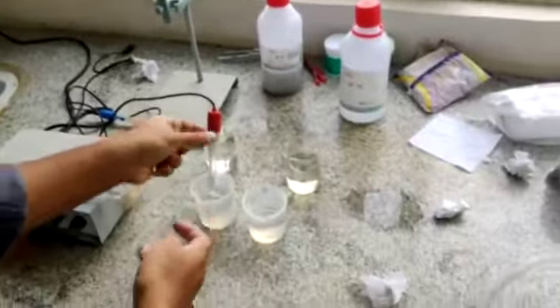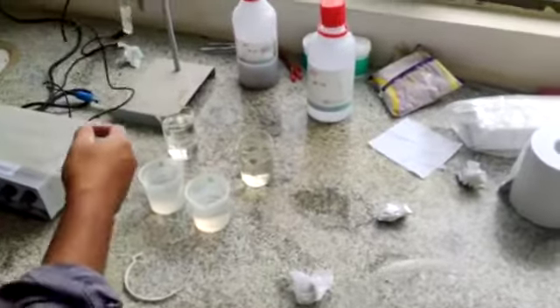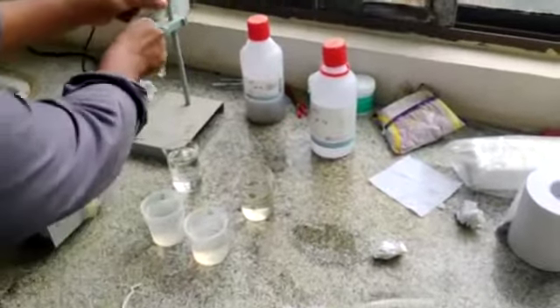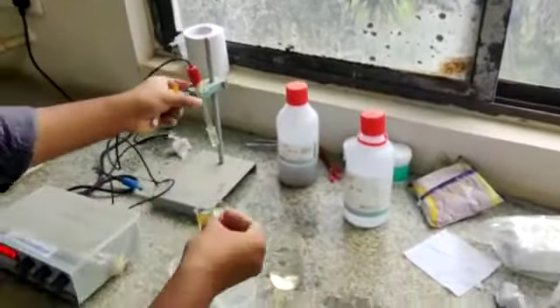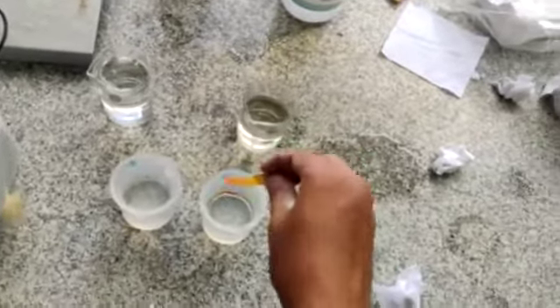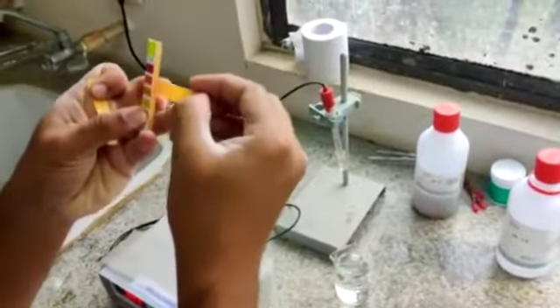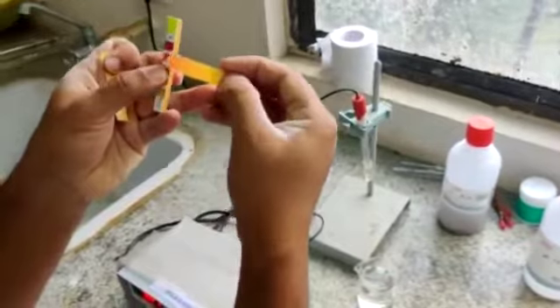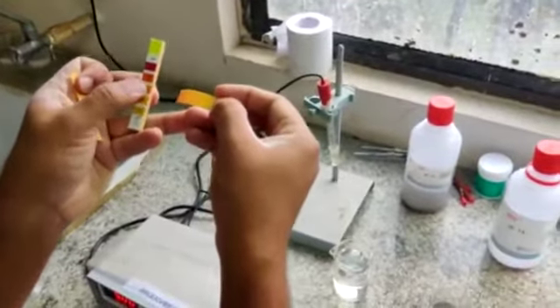So you just have to dip it to the sample. Dip it here. It will show the color change. See it is completely turning red so what it means is acidic. See, it is turning into this color 3 to 5 means it is 4 so it is an acidic solution.